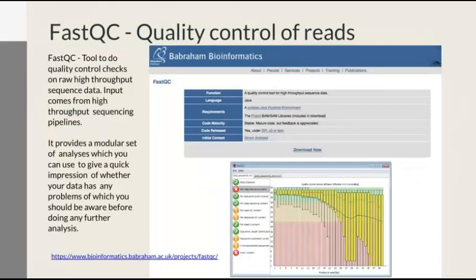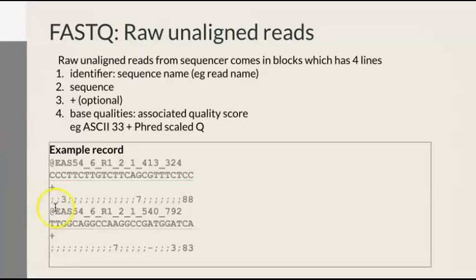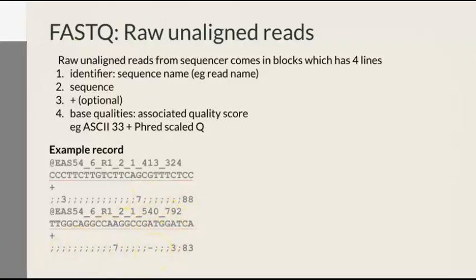Okay, so you have your FASTQ file. One of the ways you can determine quality, because it's really hard to actually go through this and try to interpret. And remember, in every reaction, you're going to have millions of these reads. For you to go through and try to figure out read by read, that's just ridiculous. That would take forever. You won't be able to do it.